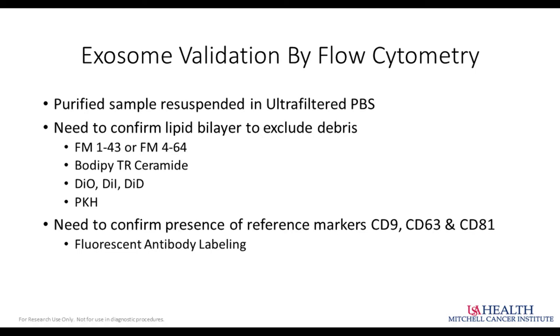So what this especially has allowed us to do is to develop a no-wash staining protocol. So we can add enough of this dye to stain, but it's not enough to cause problems with anything else. The debris particles will not pick it up. And so this has become our favorite dye to use for this lipophilic ID.